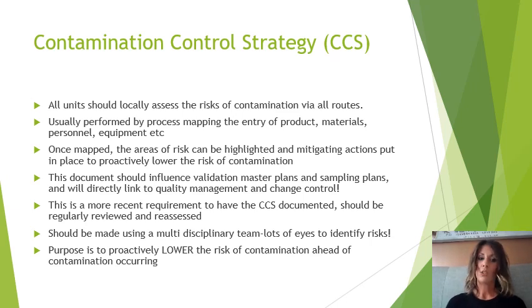This is a document. It should be quite an informed document, and it should influence validation master plans and sampling plans. And will directly link to your quality management system, and it may involve the initiation of a change control process if you identify a risk that needs mitigating. There is a more recent requirement to have the CCS documented. It should be regularly reviewed and reassessed as your processes are regularly changing and need updating.